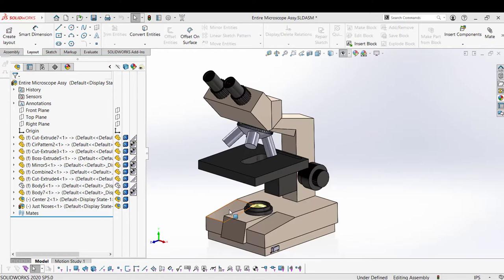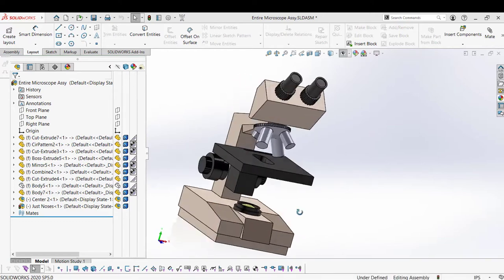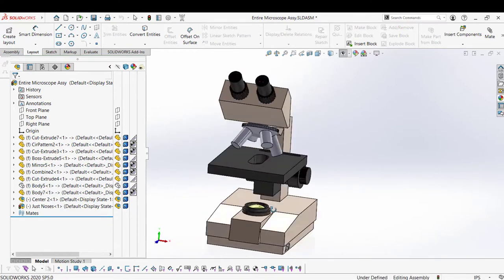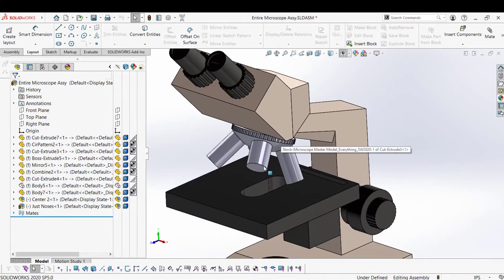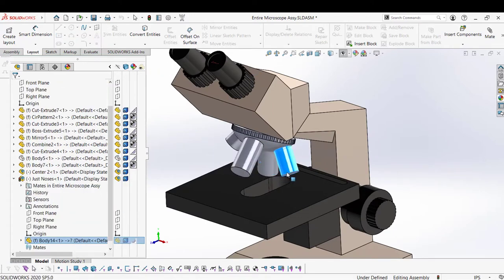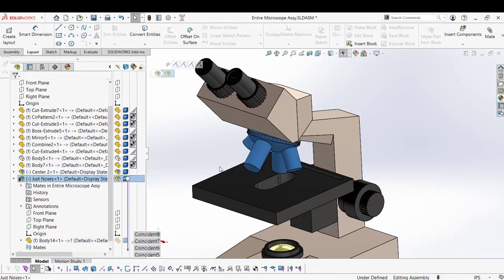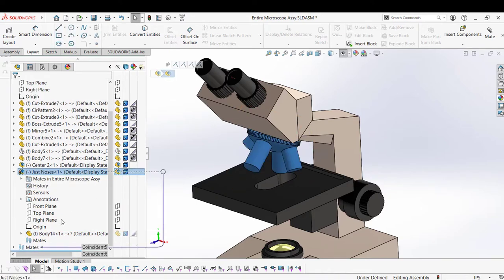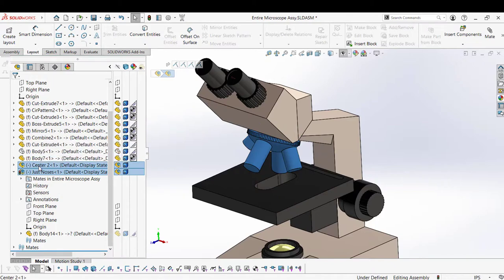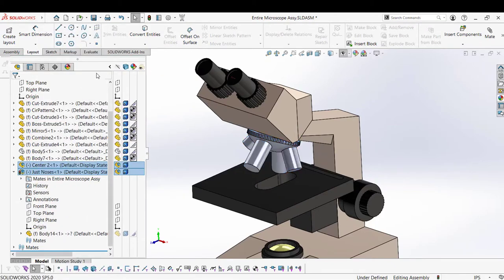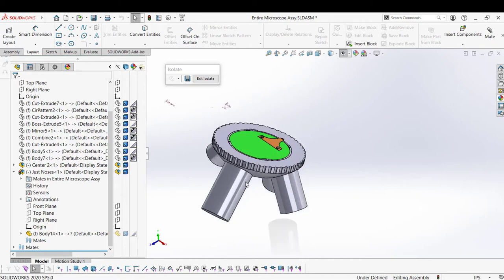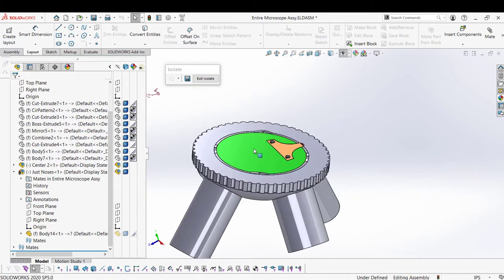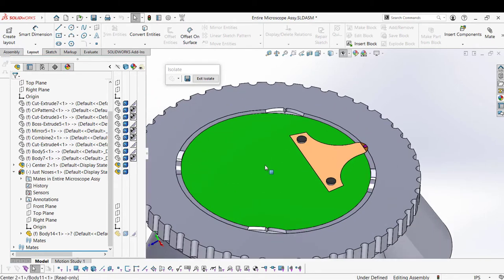So here we have the microscope that I reverse engineered for educational purposes. And this is the assembly file, as you can see the spinning nose piece, the revolving nose piece. And I'm going to show you that inside it has the center part, which I'm going to isolate to show you. We have the parts that I had in my hands. So now you see where they fit with the rest of the assembly.